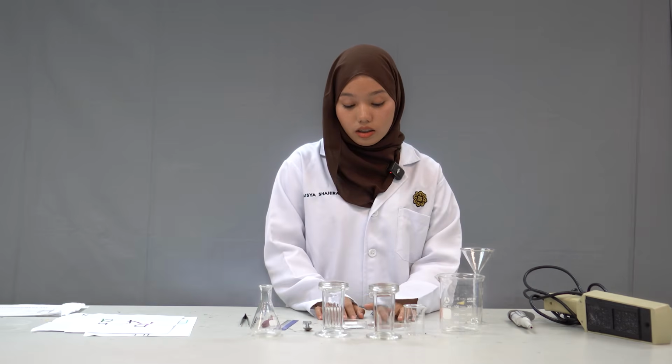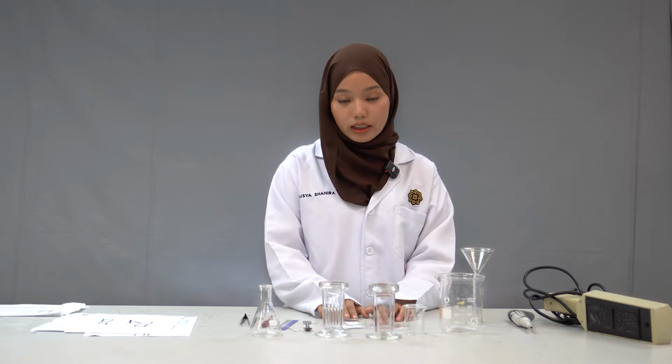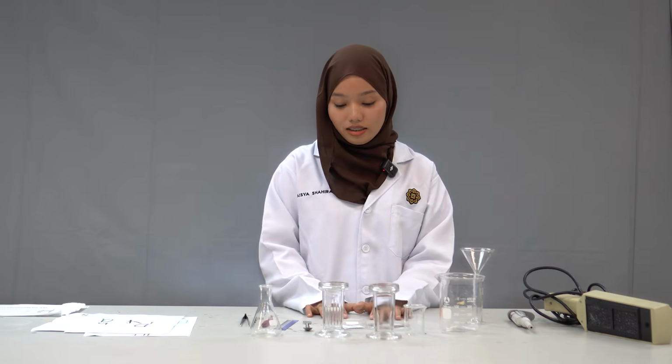Next are the health and safety precautions. First, we need to wear our lab coat, gloves, and closed shoes to protect ourselves from harmful chemical toxins, for example dichloromethane. Dichloromethane is volatile and toxic. It can cause burns and skin irritation. So by wearing gloves, we can protect ourselves from dichloromethane being absorbed through our skin.